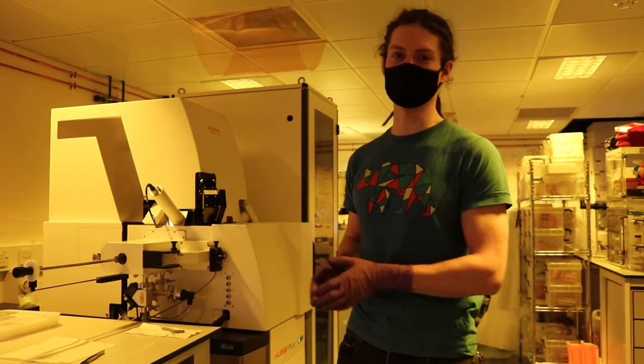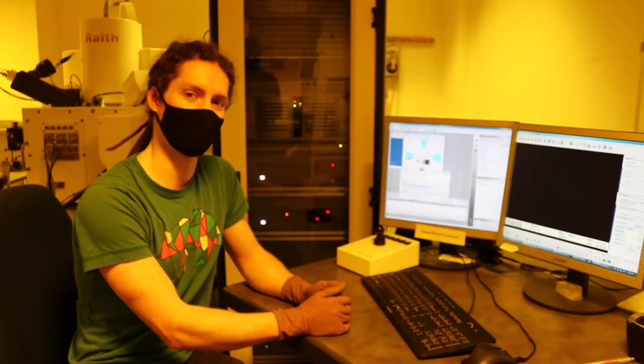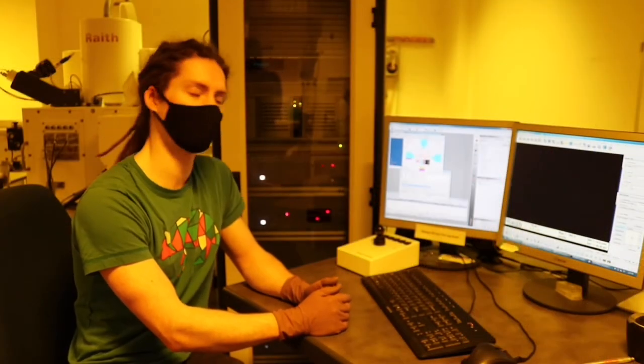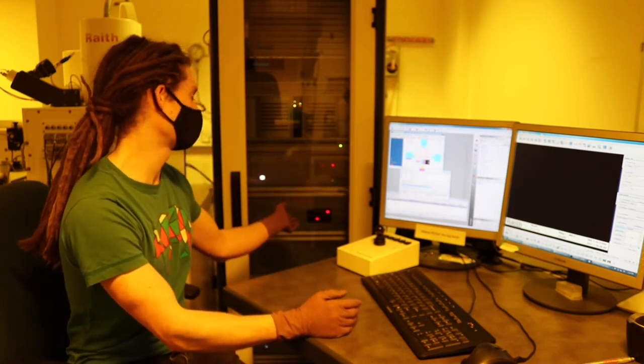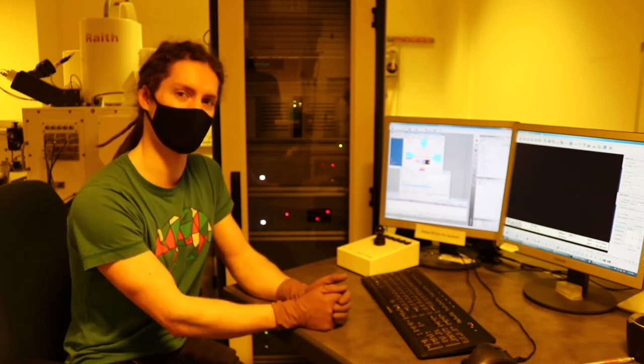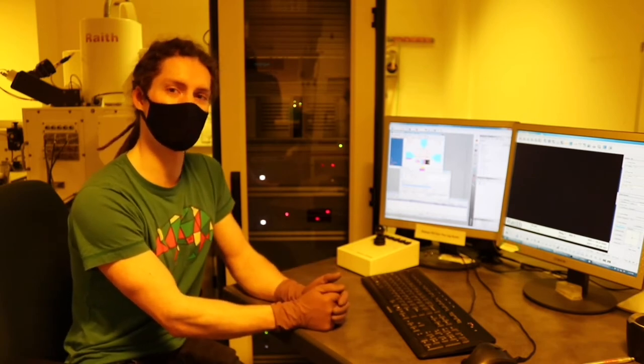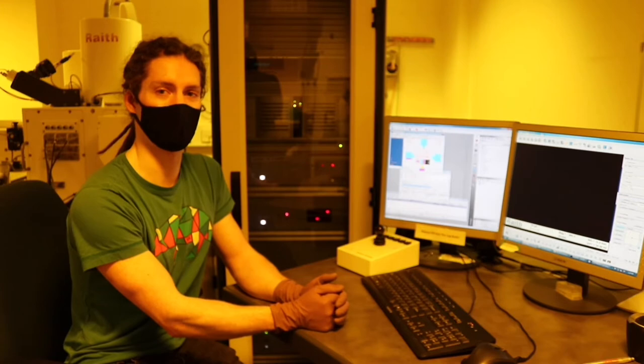The main workforce is producing samples for our experiments. This system is performing electron beam lithography onto a substrate. It's currently deflecting the electron beam over the sample to form shapes into the resist. We'll later use those shapes as a stencil to deposit material onto with our thermal evaporator.